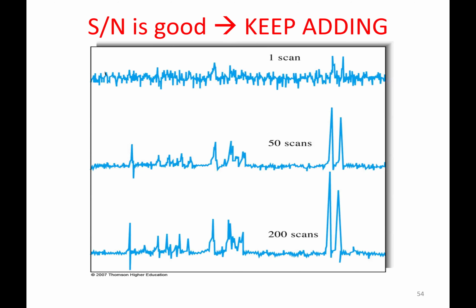So this is co-adding. This is an NMR spectrum. Let's say you have one scan there, and you notice in that one scan, you suspect that may be a peak, those are peaks. That's an NMR, just one scan. And then remember what we said, signal-to-noise ratio is proportional to the square root of what? N, where N is the number of scans. Remember we said for ensemble averaging, it's co-adding and then averaging them. So the more spectra that you acquire, the better.